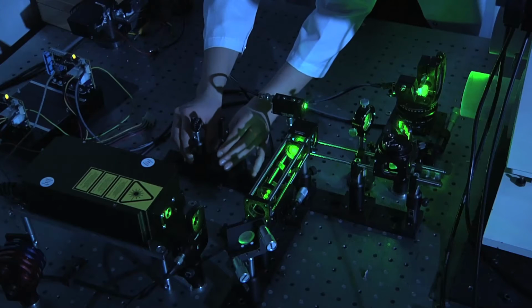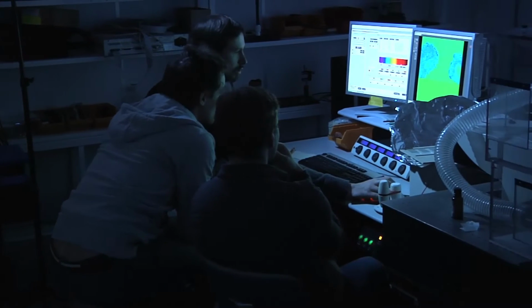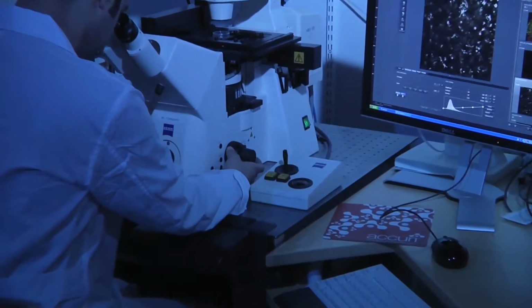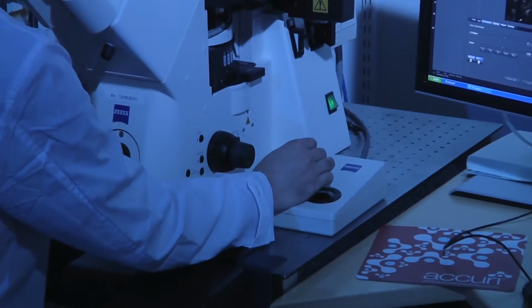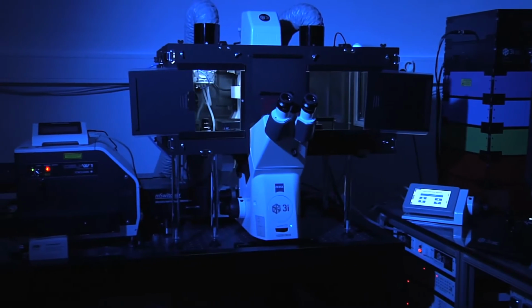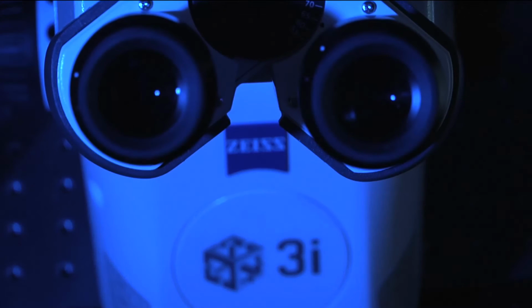A recent requirement in life science is the observation of biological processes in the context of in vivo systems. Although fluorescent microscopy techniques have developed significantly over the last decades, scientists are still limited either by the speed or by the quality of resolution when imaging 3D specimens. The spinning disc confocal system brings new possibilities, making imaging more effective compared with the widely used laser scanning confocal system.